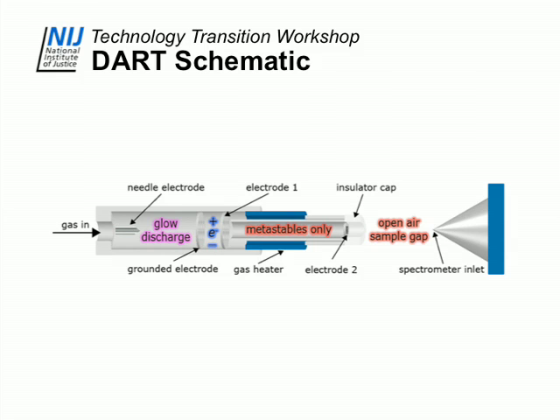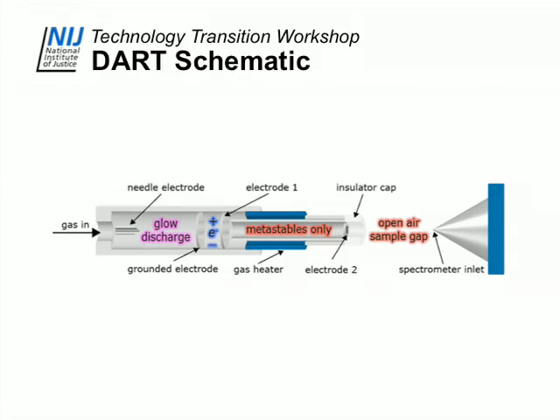The important one is a grid at the end here. And that's also a lucky accident in some ways, because we were trying to measure the current at some of the different points. I didn't want to just pull the electrode out when we took the end cap off, so we stuck some aluminum foil over the prototype and punched holes in it with a pin. It turned out the grid electrode is actually very important. I'll explain why in just a minute.